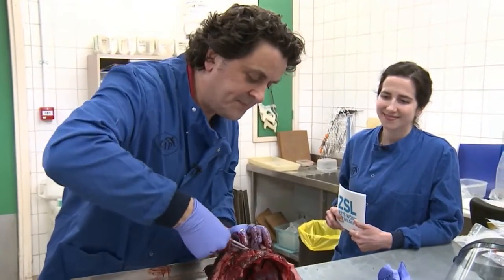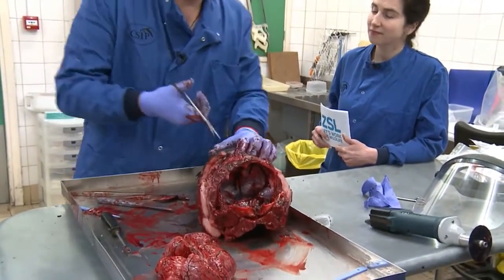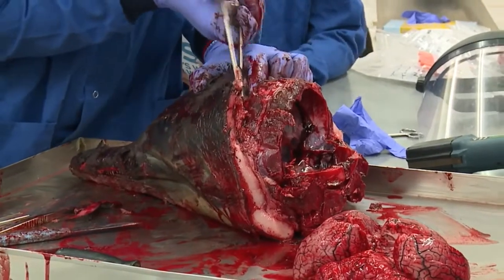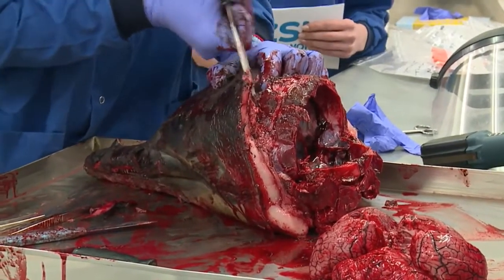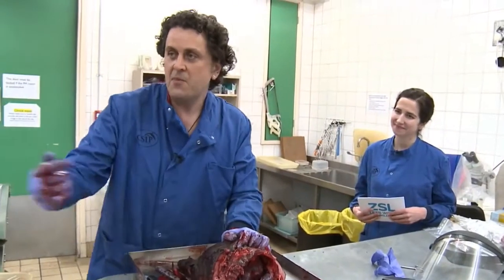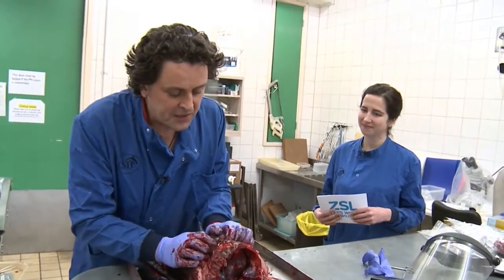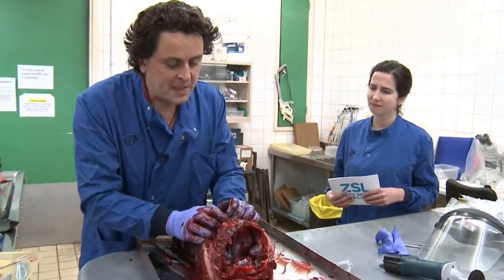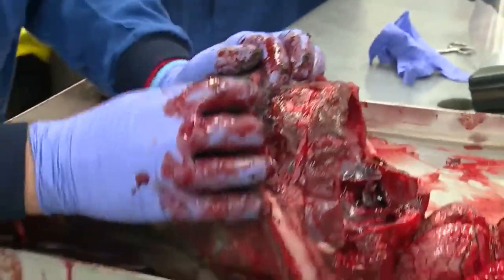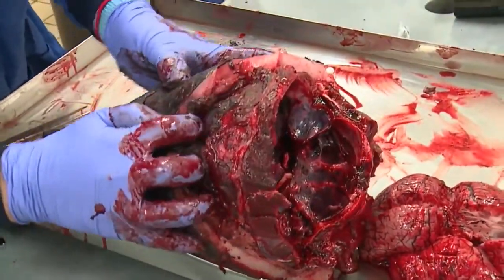So if you imagine when you blow a trumpet, your lips fit against the trumpet part. It's very similar, there's a similar idea here to these monkey lips. I'm not sure it's going to come out very clearly. Now this camera over here, quite closely. Okay. What I'm trying to show you are these monkey lips. As I pull back, and I'm going to pull quite hard, can you come down? Is that possible? Okay.